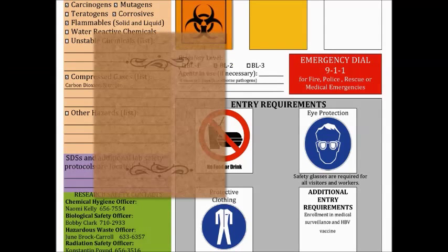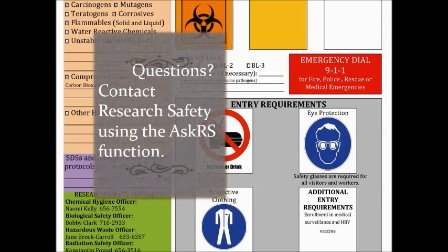If you have any questions about this sign, you can go to the Research Safety website and use the Ask RS function. You're also welcome to email me. My email address is rclark3@clemson.edu.